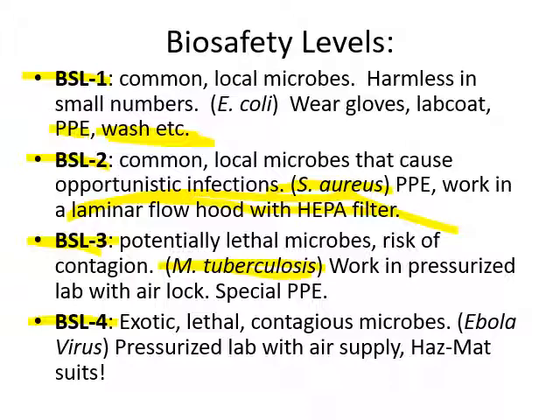So you're wearing this suit like a deep sea diver's suit, that has positive pressure on the inside so that the air is not going to leak from the laboratory into your suit. If you have any leaks, the air is going to leak from your suit out into the lab, but not the other way around. Okay, so that's biological safety level 4.